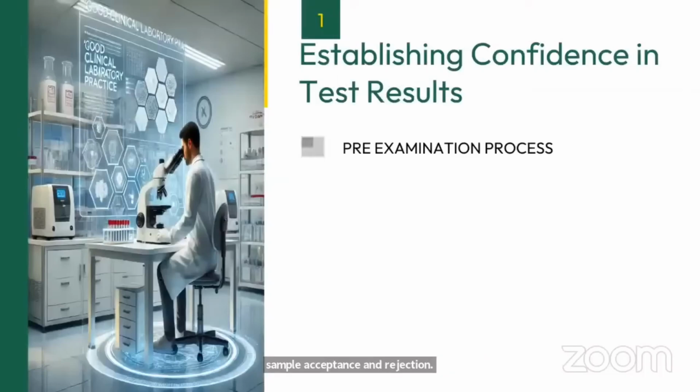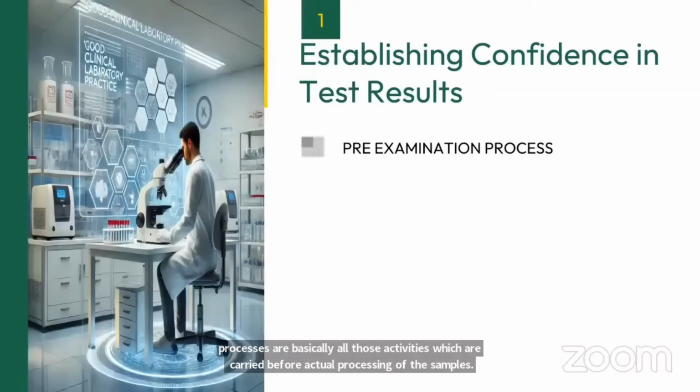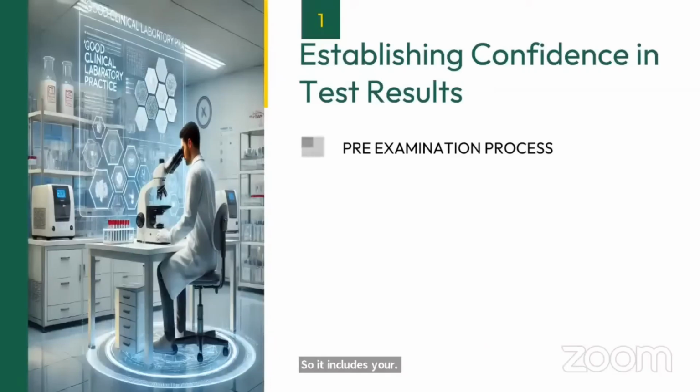So first of all, to begin with pre-examination processes, as I mentioned during the first session in our definitions, pre-examination processes are basically all those activities which are carried out before actual processing of the sample. So it includes your test requisition or a request which is raised by a clinician or by the patient himself. Then the sample collection part.